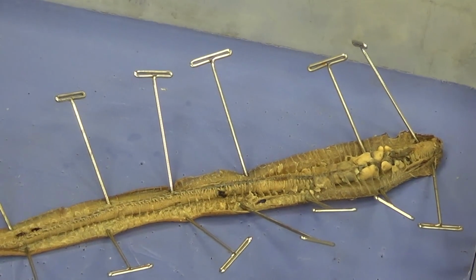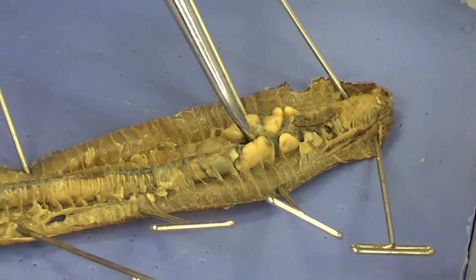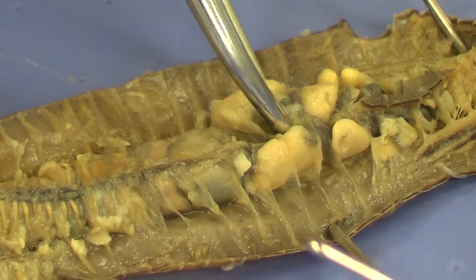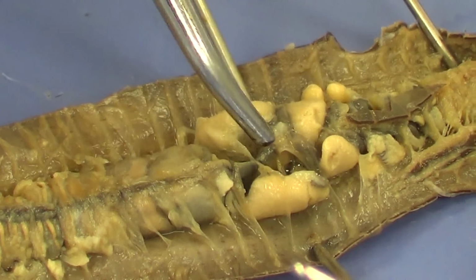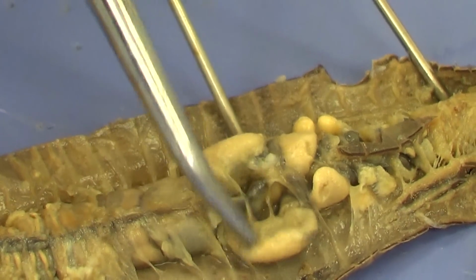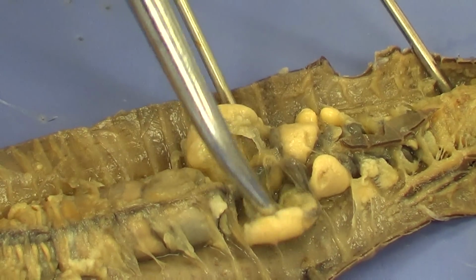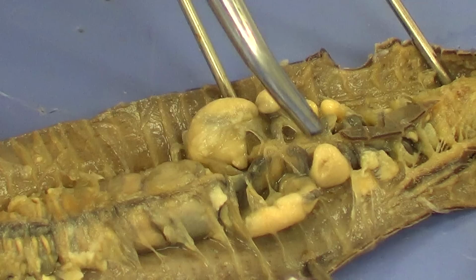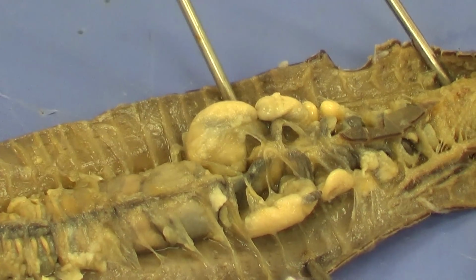Now let's go ahead and take a look at these cream-colored structures right here. We're going to have to actually move them out of the way in order to see our aortic arches. So as you're dissecting, just give them a gentle push. Try not to tear them, but just push them out of the way a little bit. Those are our seminal vesicles. And again, those are used to actually produce the sperm. I'm going to move those seminal vesicles out of the way a little bit.